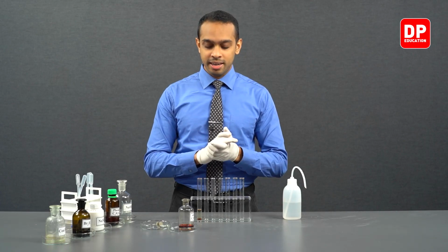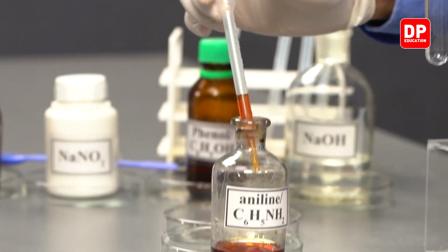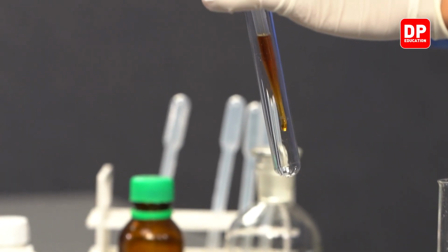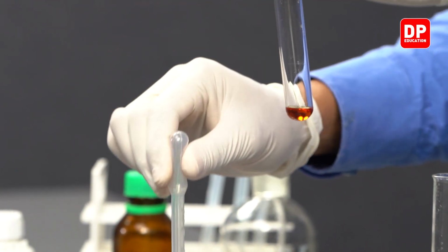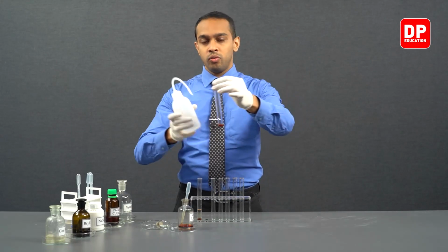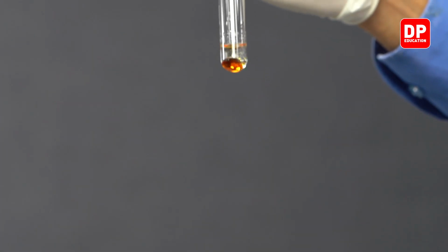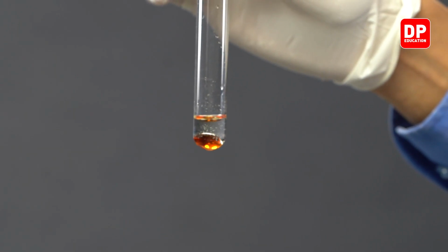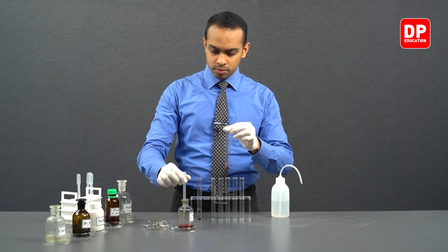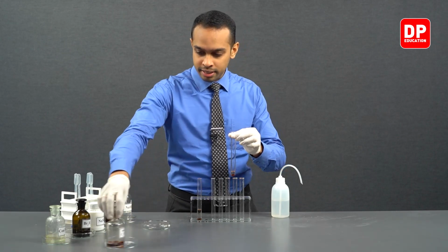Now, let's take another small portion of aniline into a different test tube. And to this, we'll add a small amount of water so that we can clearly see what happens when we add HCl. When a small amount of water is there, we can very clearly see the layer separation. Now, let's add a small amount of HCl.